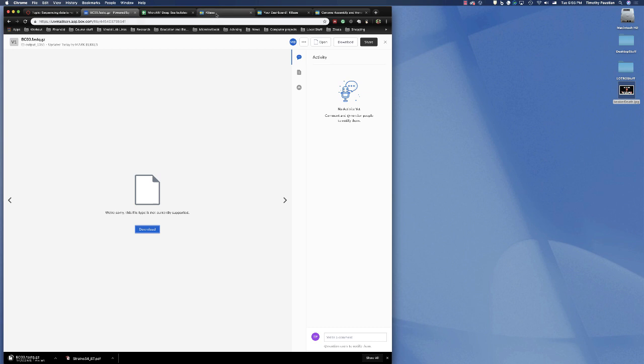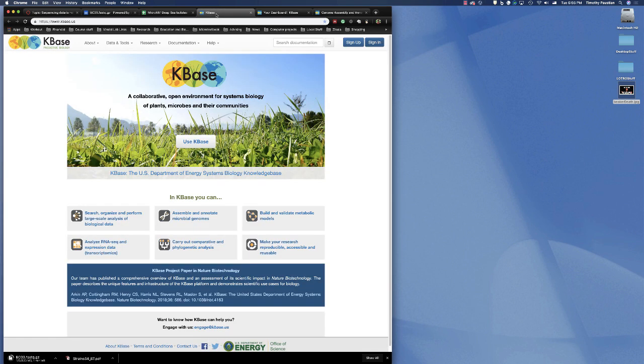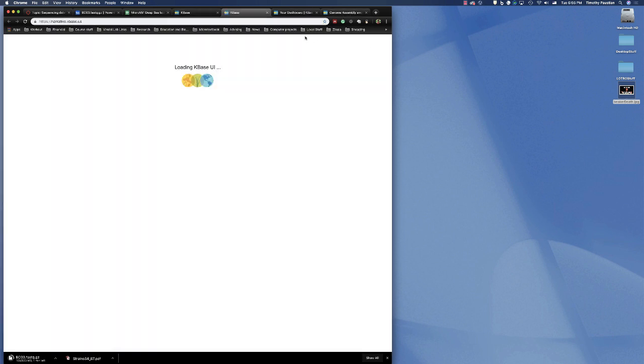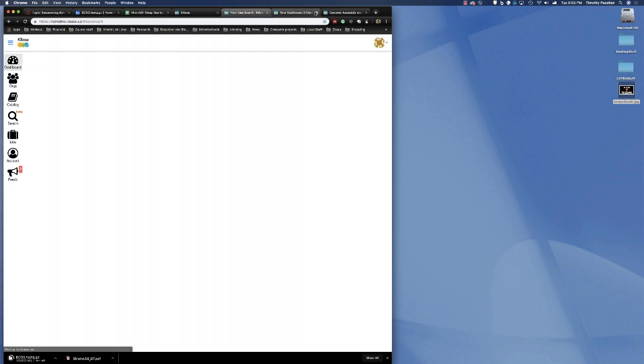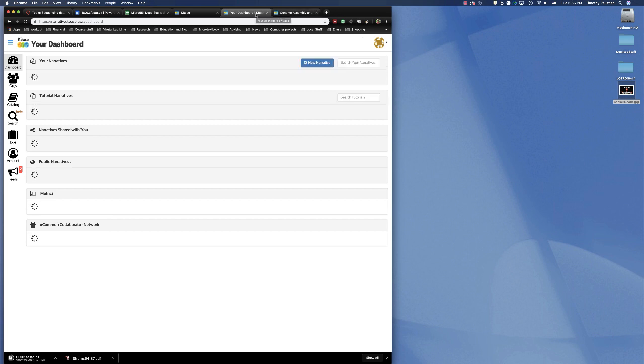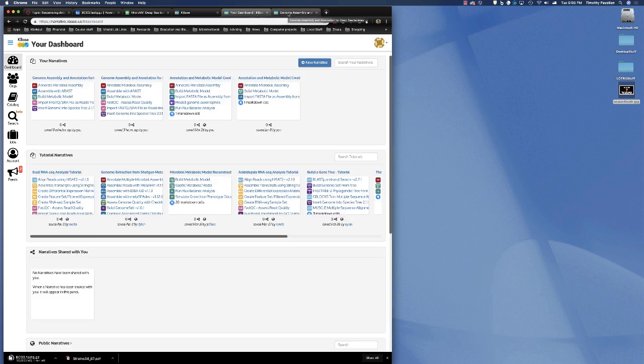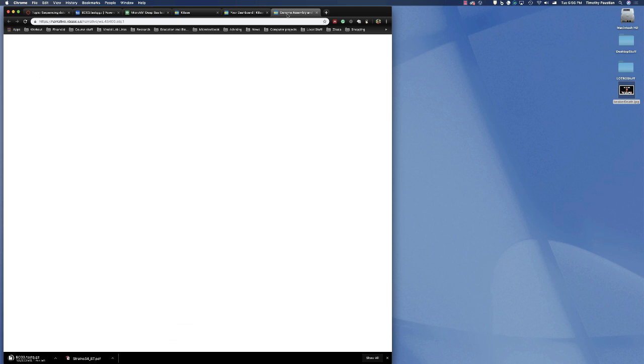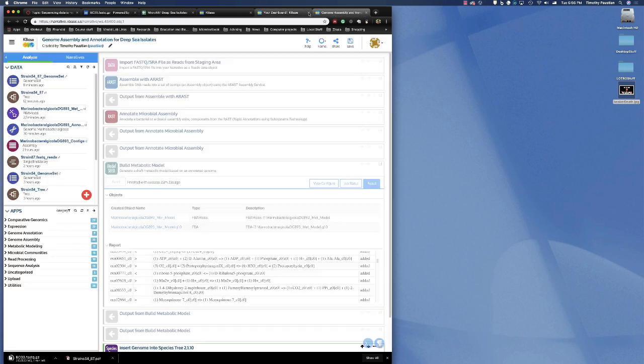In the meantime, while we're waiting for that data, you'll want to go to your KBase account, which again, you set up before. You're going to want to sign in and you'll have a dashboard. We're going to do a somewhat different narrative. In this case, we're going to do a genome assembly narrative.